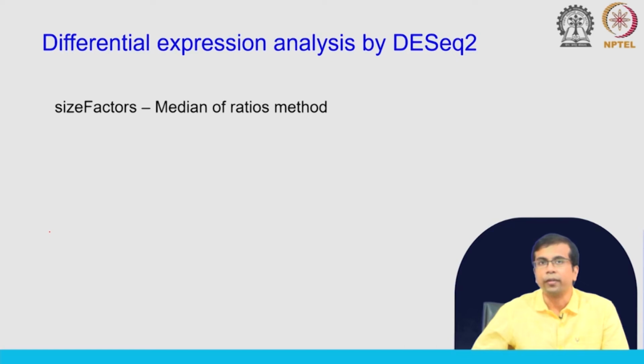So, I will show you, right. As I mentioned, DESeq2 uses this median of ratios method, right. So, it actually calculates something called the scaling factor or normalization factor, and in the DESeq2 package these are called size factors, right. These are nothing but the normalization factors or scaling factors calculated in the median of ratios method.